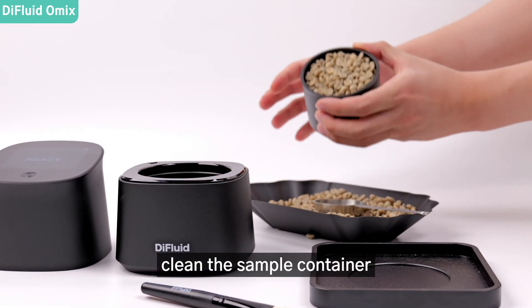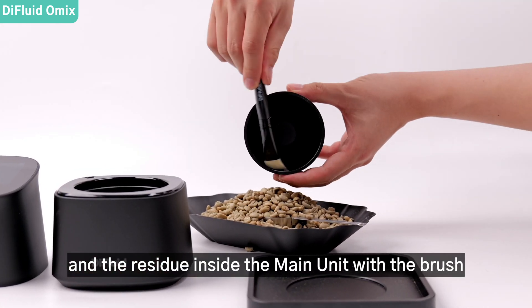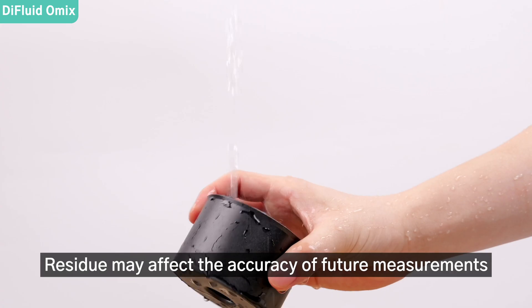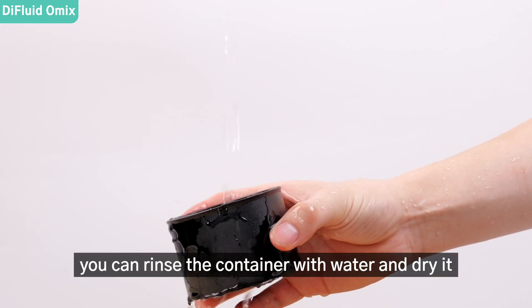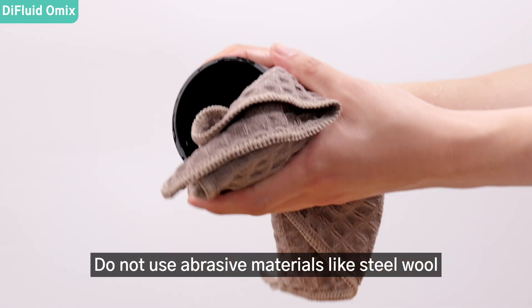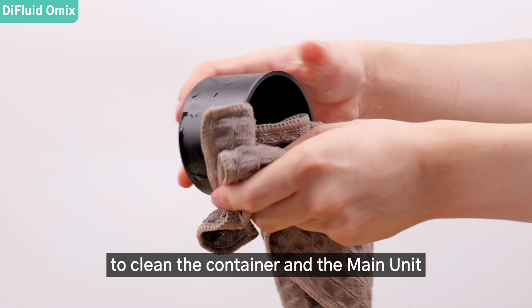After use, clean the sample container and the residue inside the main unit with the brush. Residue may affect the accuracy of future measurements. After testing wet samples, you can rinse the container with water and dry it. Do not use abrasive materials like steel wool to clean the container and the main unit.